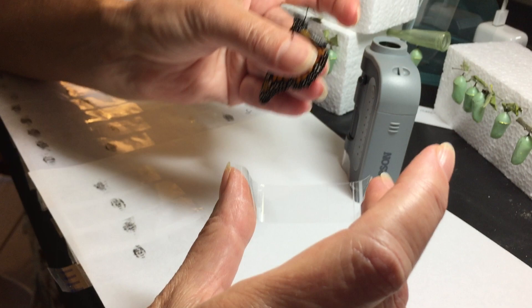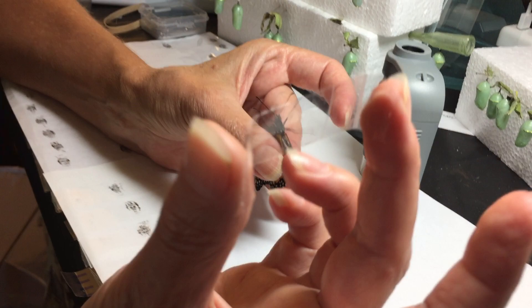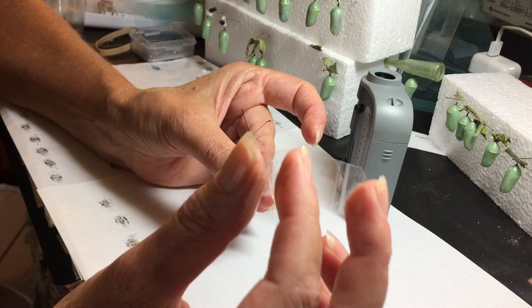Today I'm going to show you how to test a Monarch Butterfly for OE. I have clear crystal tape between my middle finger and thumb so that I can push in the center. I'm going to apply the tape to the abdomen.